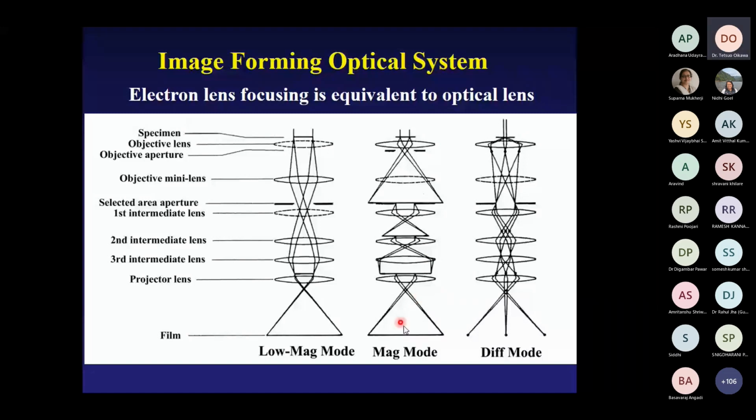And also, owing to the small wavelengths, resolution is very high, and we can observe atomic resolution imaging under high magnification conditions. Okay. Sometimes we also need a very low magnification, the same as the optical microscope. In this condition, the objective lens is turned off.